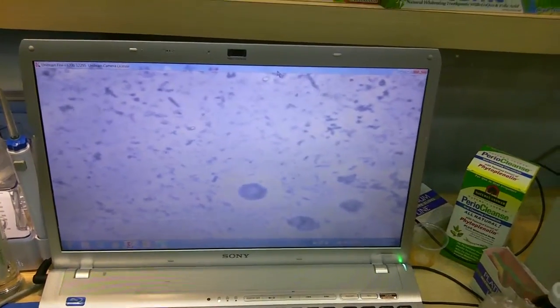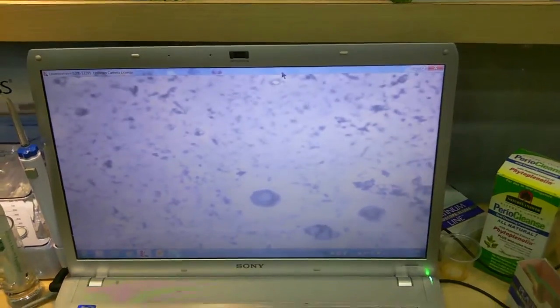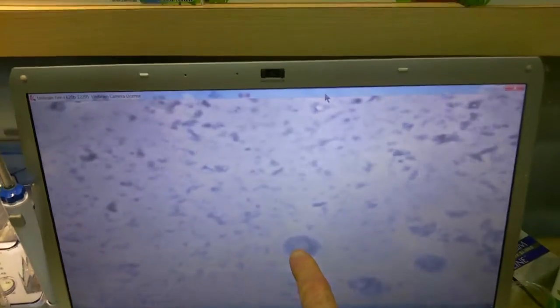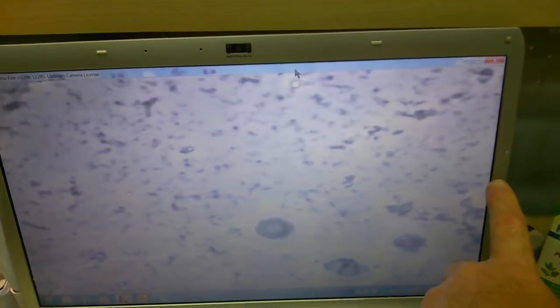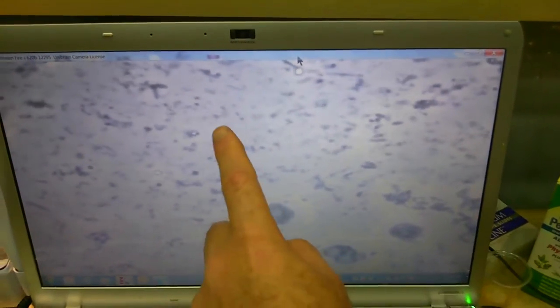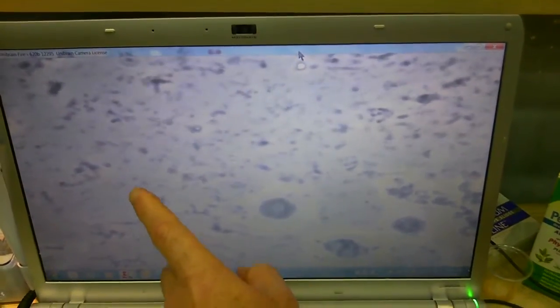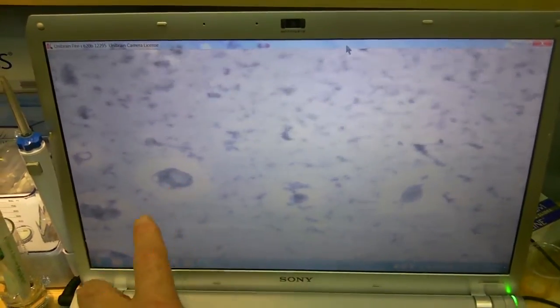What we're seeing here in this picture are actually quite a few bacteria. What we have here are white blood cells — these are white blood cells. We have this little squiggly thing — that's actually a big squiggly thing — that was a spirochete. We have a lot of small little black dots, which are either strep or staph. And I see a lot of white blood cells.